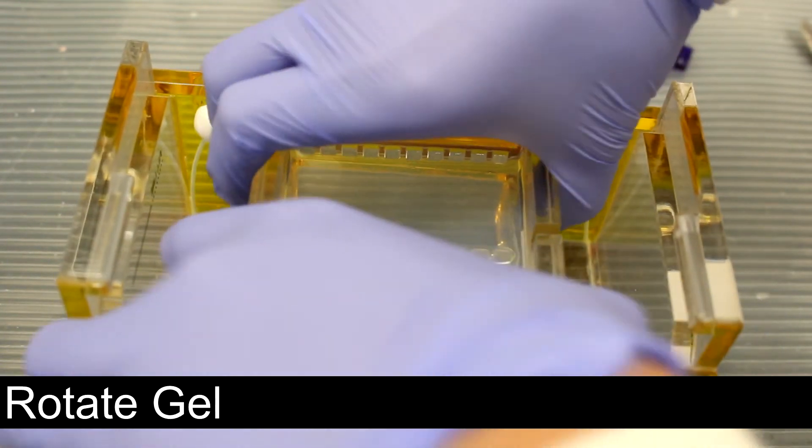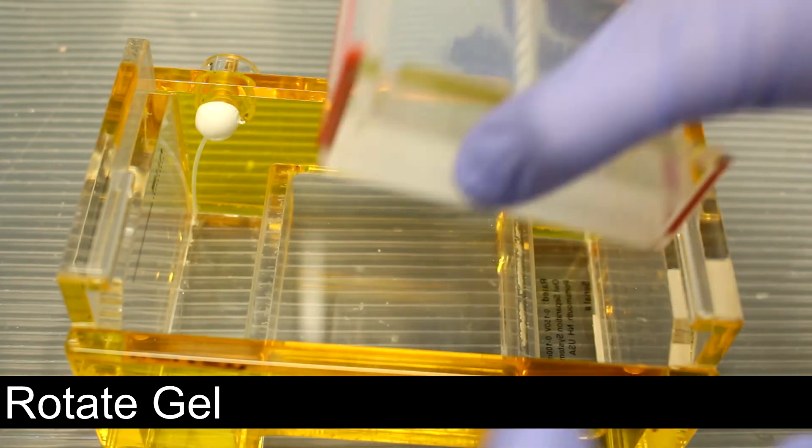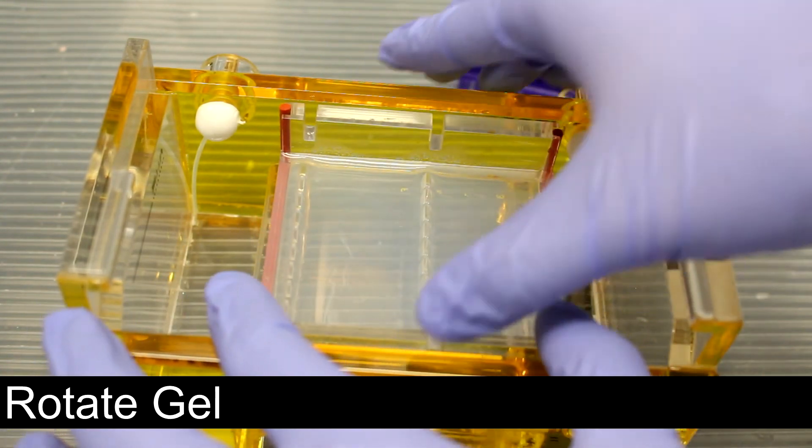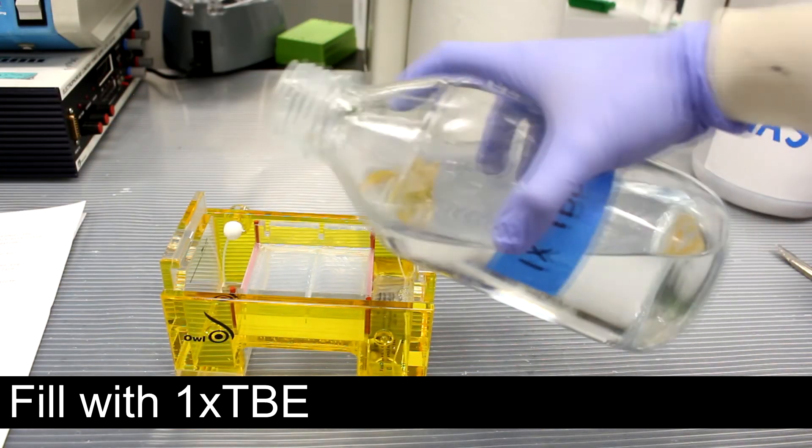The gel is rotated to where the wells are on the side with the negative electrode. 1x TBE is poured into the gel rig until it passes the level of the agarose gel.